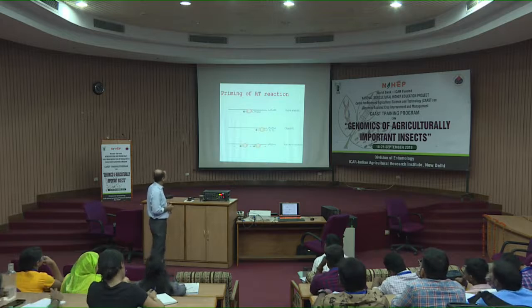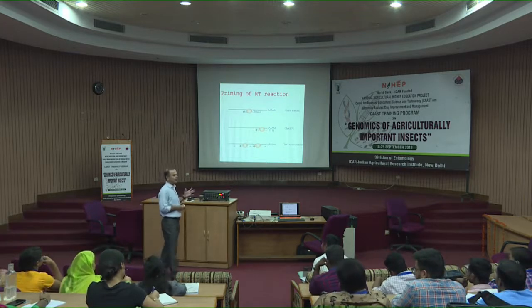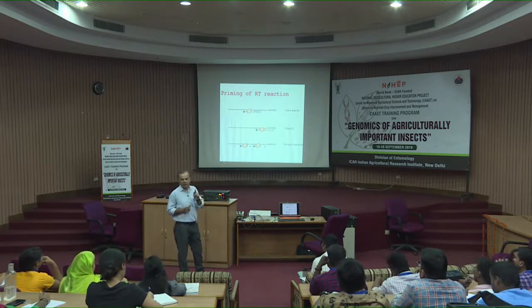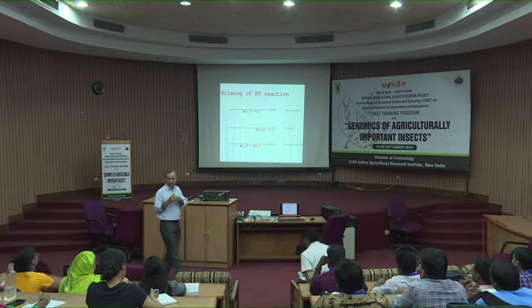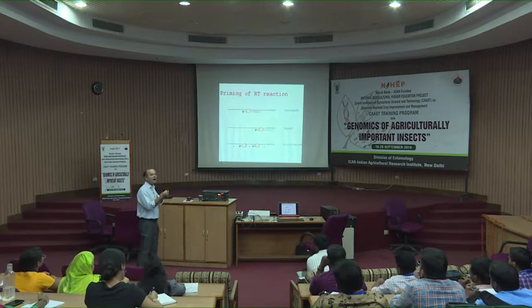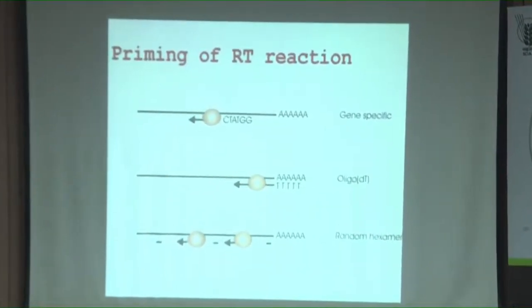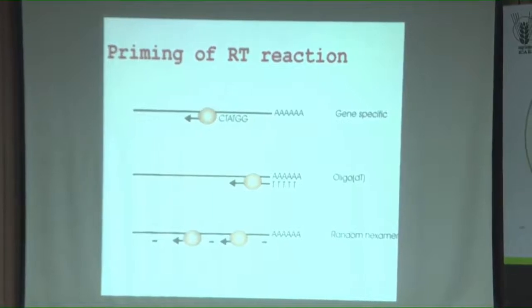And in doing this reverse transcription, again like DNA polymerase, essentially you need a primer. It cannot start the copying process de novo. You have to start with an existing small piece of DNA, right, or oligonucleotide, and then the enzyme can add on. So, essentially in doing reverse transcription reaction, you have to take a primer sequence. Your substrate here is mRNA, right, and your enzyme is reverse transcriptase. So, what are the other things you got to add into the reaction cocktail? You have to add a primer, you have to add dNTPs, right, enzyme and the proper buffer for that enzyme.